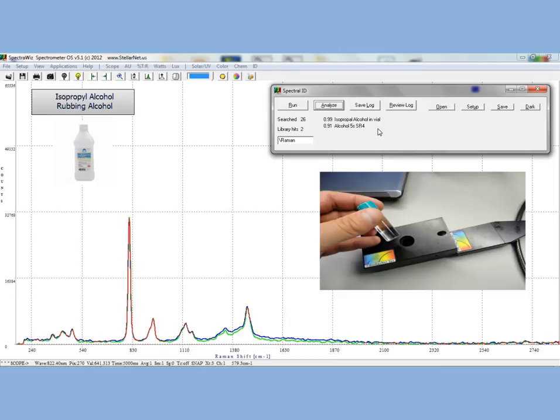Once I collect the spectra, I click Analyze and I see that the library correctly identifies the sample.